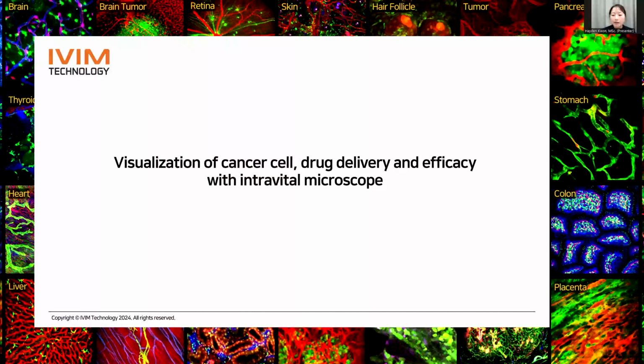Next, I have prepared data showcasing the real-time observation of immune modulatory responses to various drugs targeting specific cancer cells. These observations were conducted using a range of window and chamber implanted mouse models to study how these drugs regulate immune cell activity for therapeutic purposes.